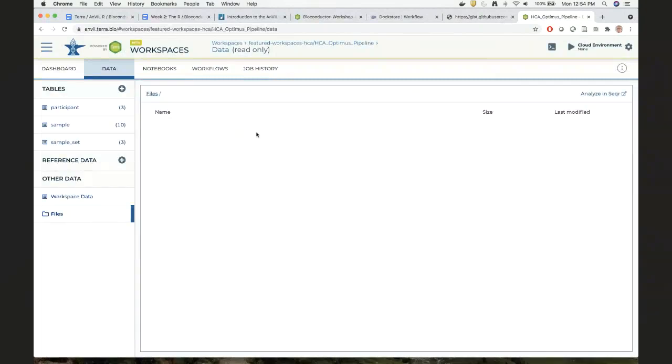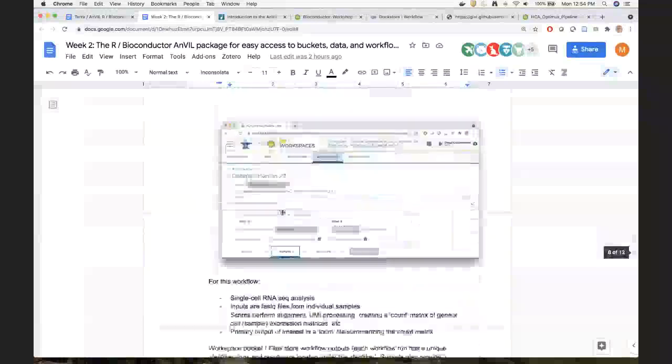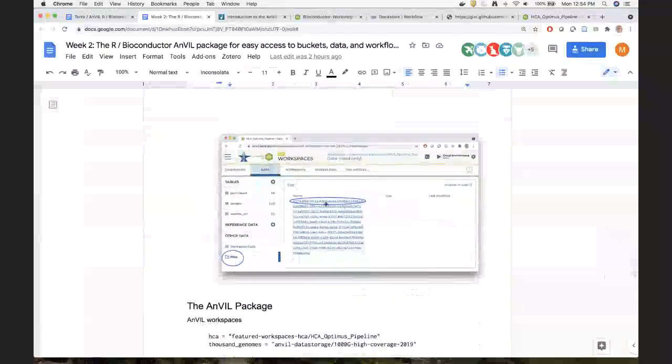But you can see in the notes in this notebook, each time there's a run of the workflow, it creates a whole bunch of entries in the Google bucket, one for each of the workflow runs. You can think of it sort of like a file system, but it's an object store. Somewhere inside each of these is the Loom file that we're interested in.